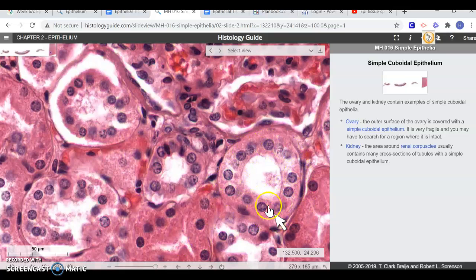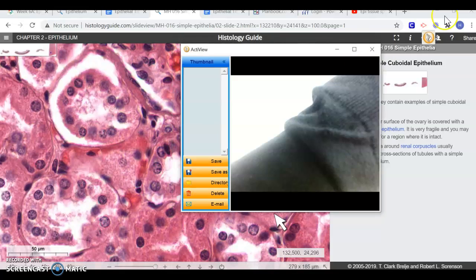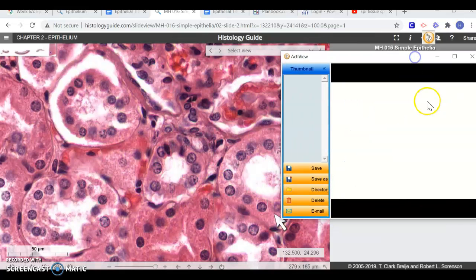This one that's got an arrow pointing to it is an awesome example, and this is what we're going for to draw on our lab. I'm going to try to bring my other screen in too so you can see both at the same time, because hopefully that'll help us as we go to draw this. So bear with me a minute here. Okay.